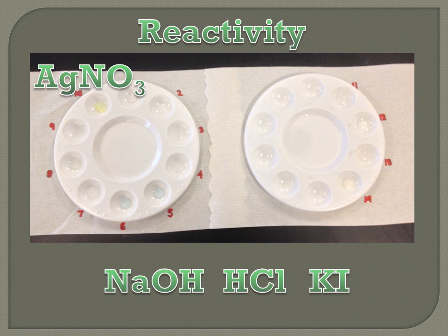We performed reactivity tests on all 14 solutions with silver nitrate. You could see some of the solutions did not react at all, while some changed color entirely. The process was then repeated using sodium hydroxide, hydrochloric acid, and potassium iodide.